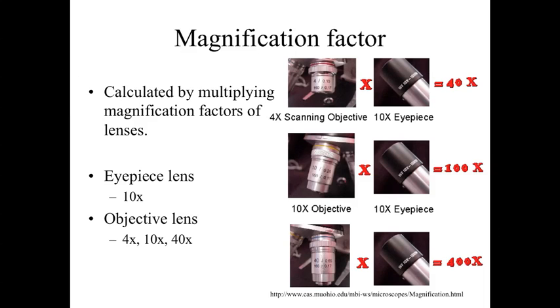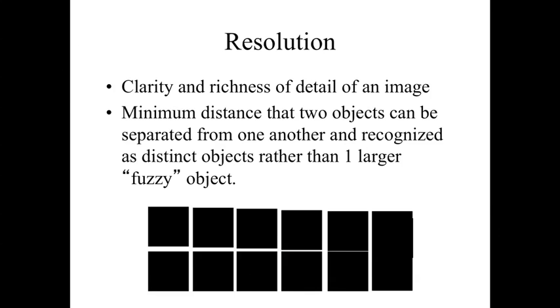Now, if we're using this with our eye, looking through the microscope, we would use this. But when we look at these images, it's the same basic idea, because instead of using our eye, we're using a camera, which is going to be collecting and creating digital images, but using the same basic concepts of magnification. So we can make the image larger.